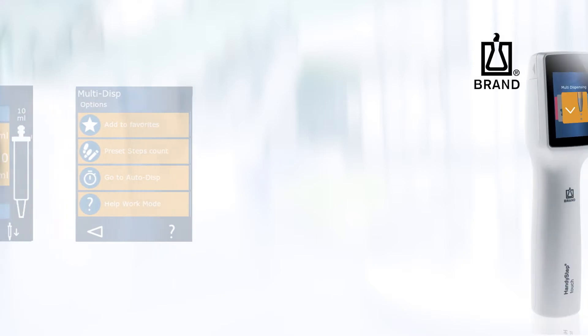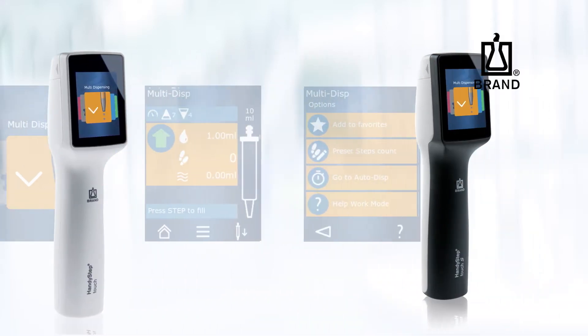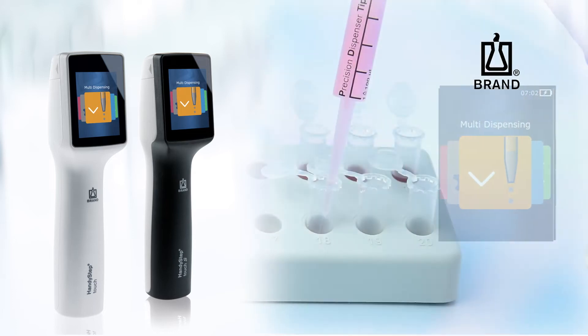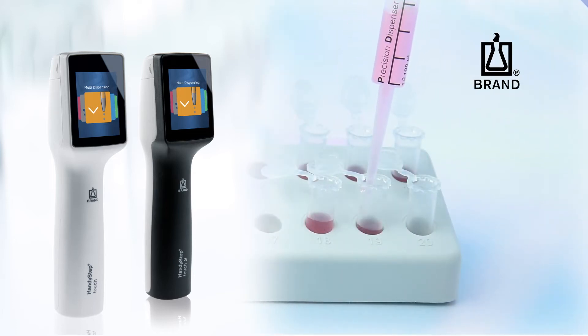The multi-dispensing mode is available on both the HandyStep Touch and the HandyStep Touch S. The multi-dispensing mode allows for the aspirated volume to be repeatedly dispensed at a set volume.